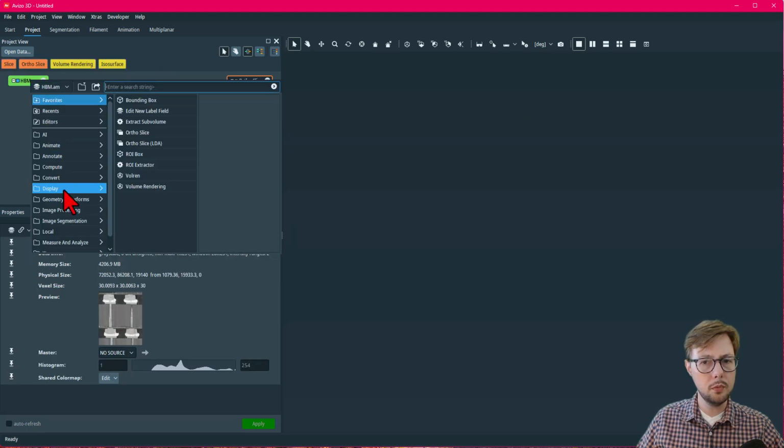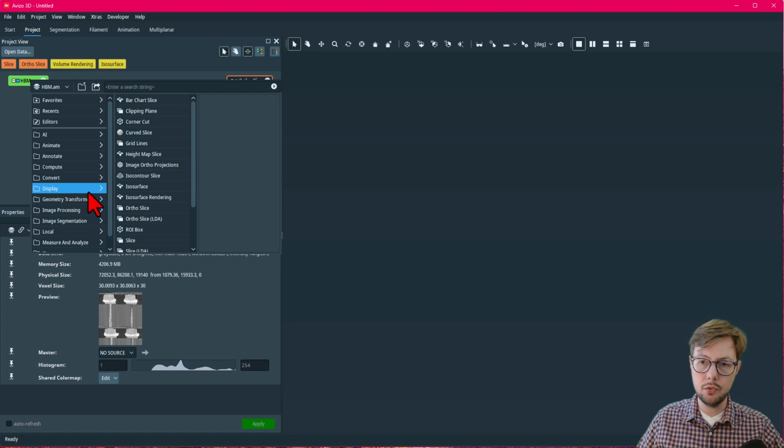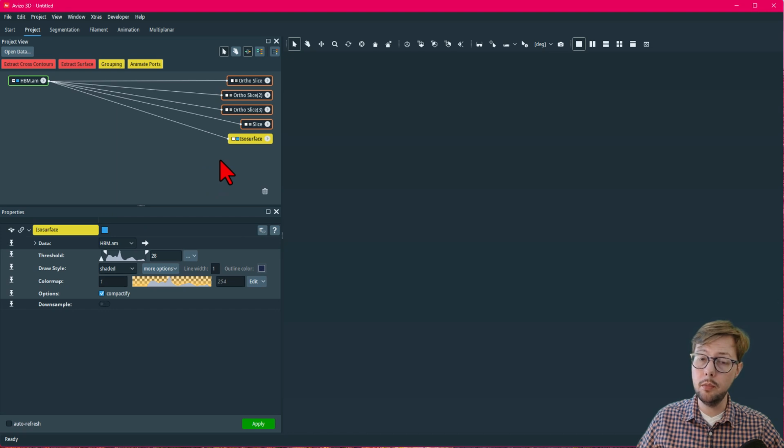Once more, open the module browser and attach an Isosurface. This display will draw an enclosed volume for all regions brighter than some user-defined threshold. A histogram of intensities can help guide you. Use downsampling for large datasets for faster processing.